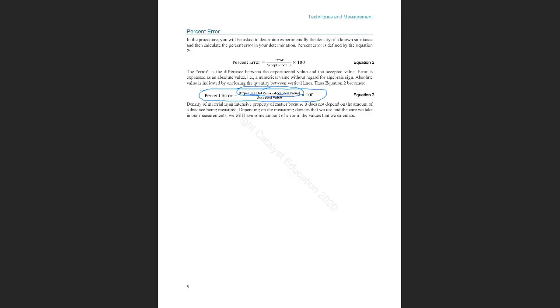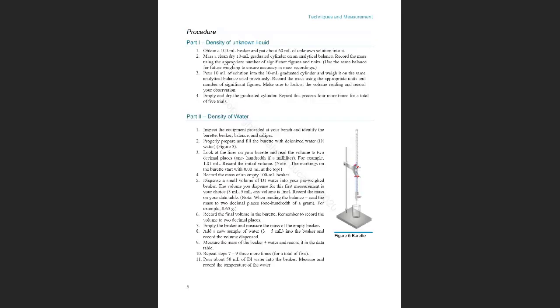So the accuracy is telling you how close your value is to the actual value. That's all it is, actually. And then for now, let me see. Here, they will tell you how to proceed with the experiment.